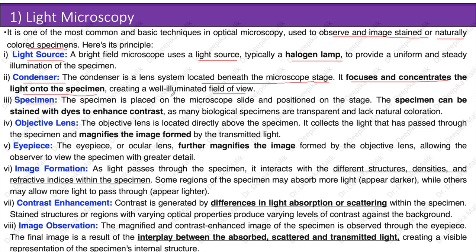The specimen is placed on the microscope slide and positioned on the stage. It can be stained with dyes to enhance contrast, as many biological specimens are transparent and lack natural coloration. The objective lens, located directly above the specimen, collects the light that has passed through the specimen and magnifies the image. The eyepiece or ocular lens further magnifies the image formed by the objective lens, allowing the observer to view the specimen with greater detail.